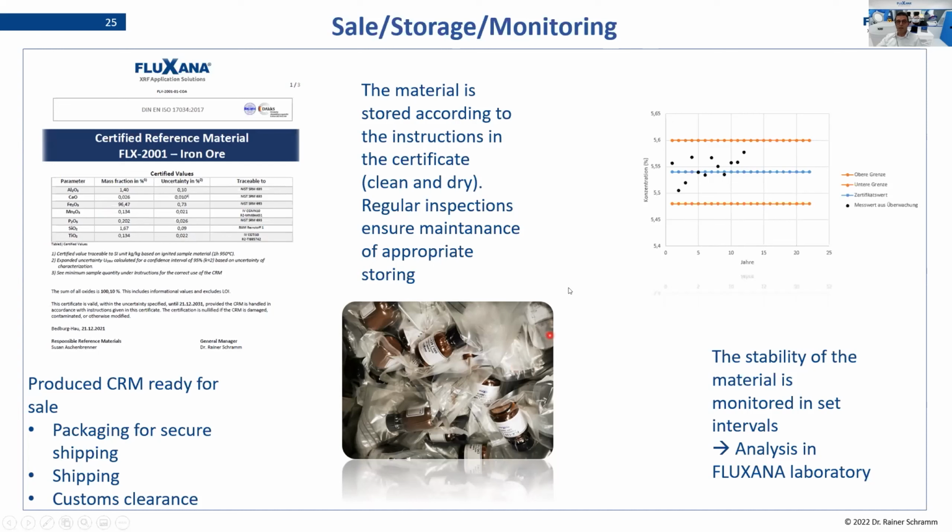But nevertheless, we have to monitor the stability, and this we will do over the whole lifetime of that material. The oldest materials we have in stock are already around 12 to 15 years, so we have quite good experience with these. And then you can see if the values are still in the expected range.